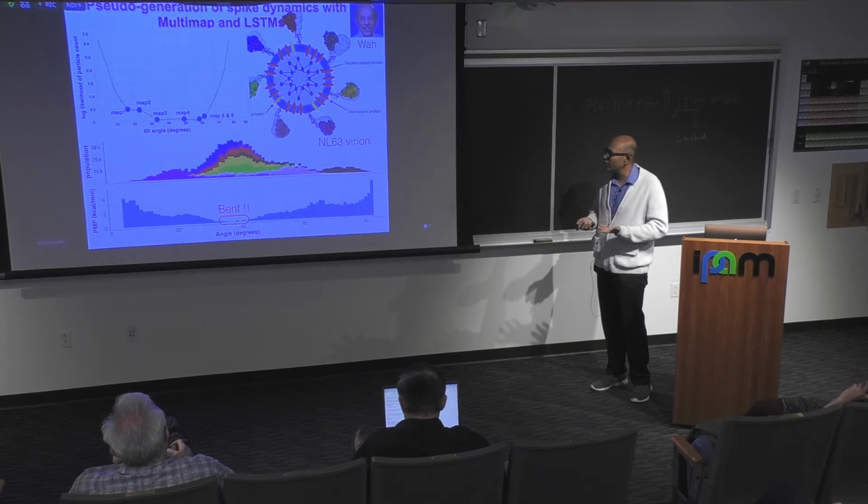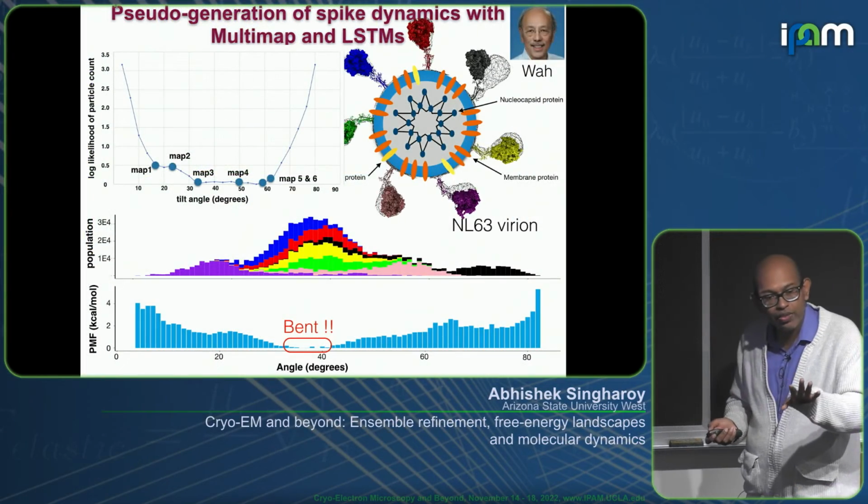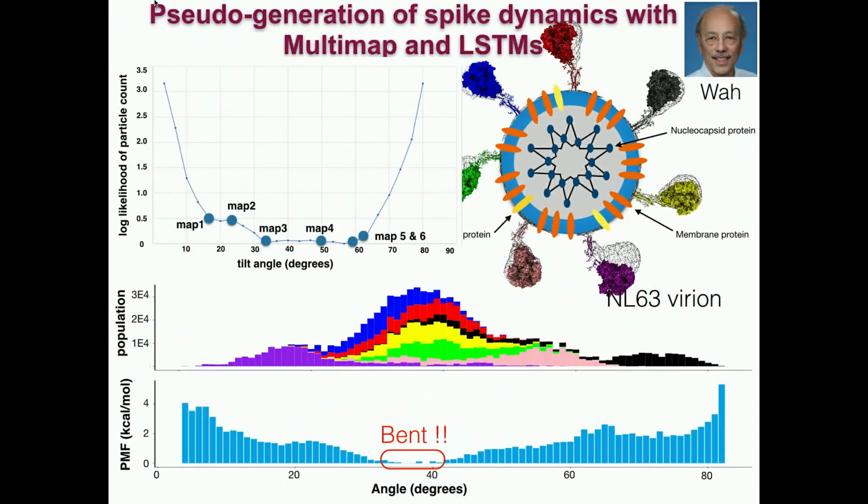I can reconstruct a surface right now by the statistics. So essentially by using these sort of Bayesian inferencing methodologies and experimental data of density, not images, we can reconstruct free energies. That possibly is more easy. But again, what does this free energy mean?